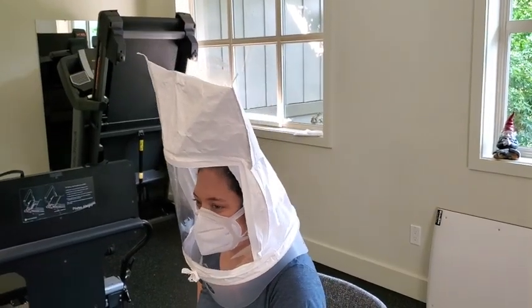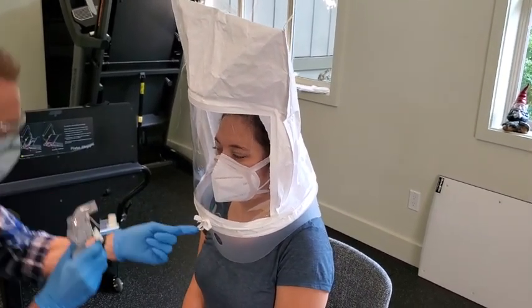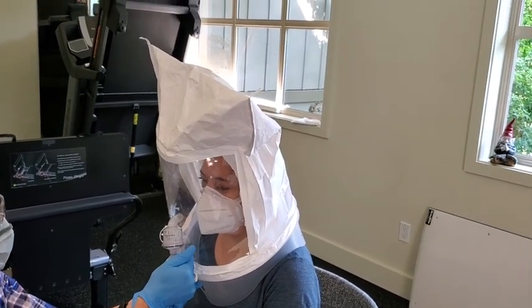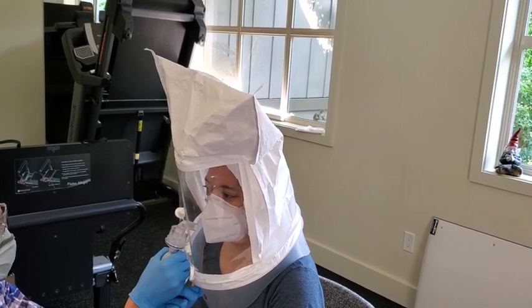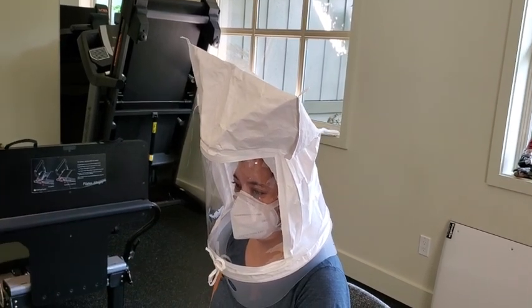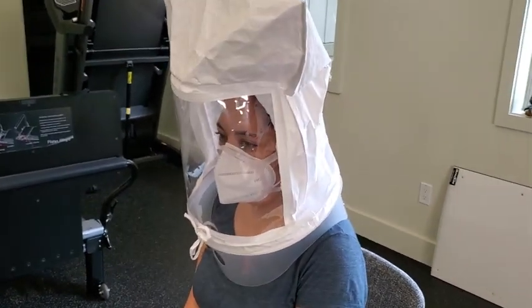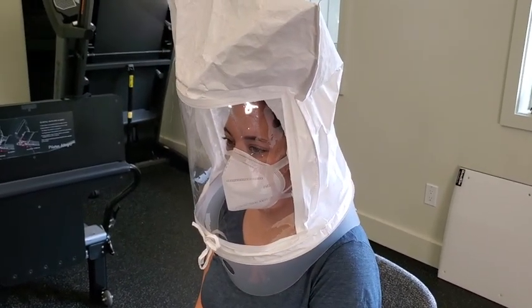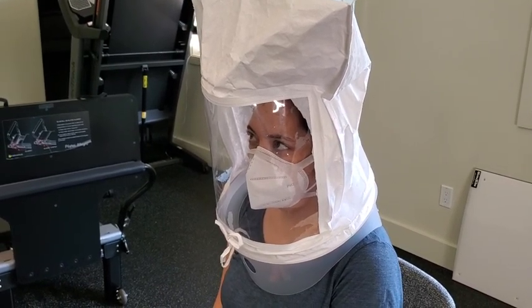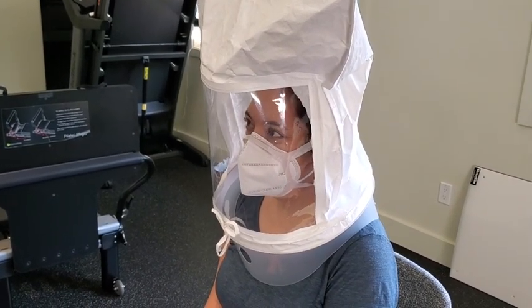Okay, so same thing as before. 2, 3, 4, 5. And you wait 30 seconds. You just breathe normally. We cut out the 30 seconds part.